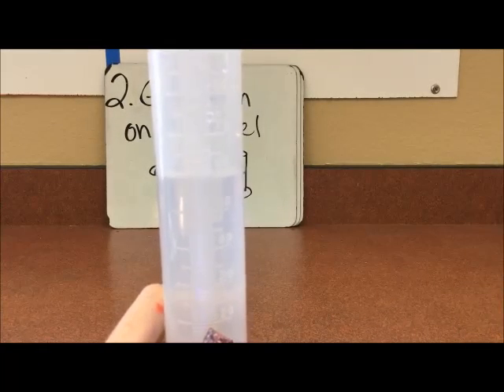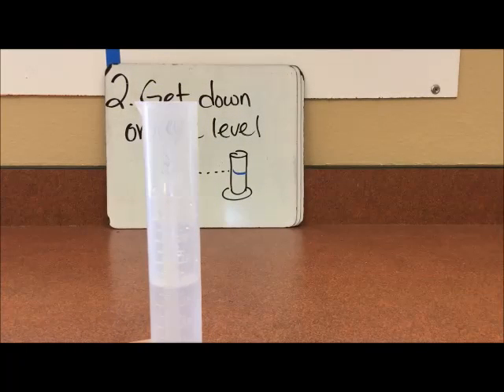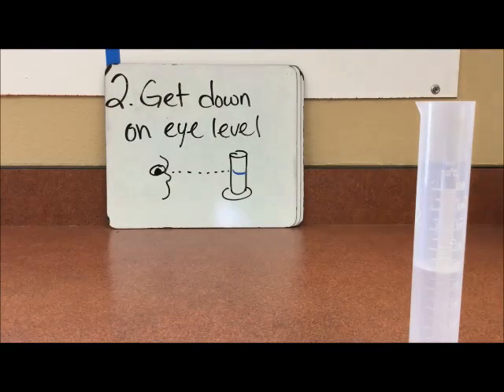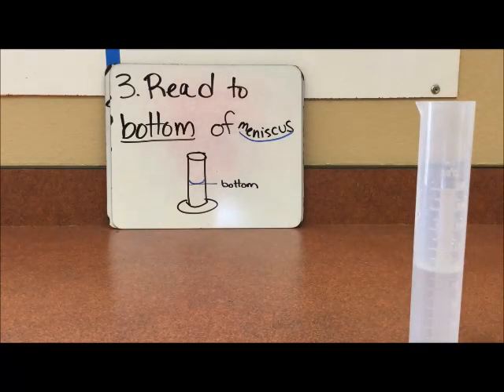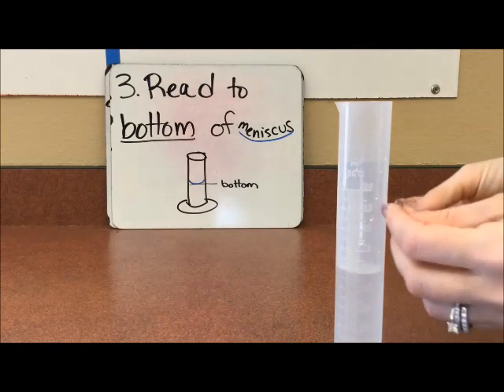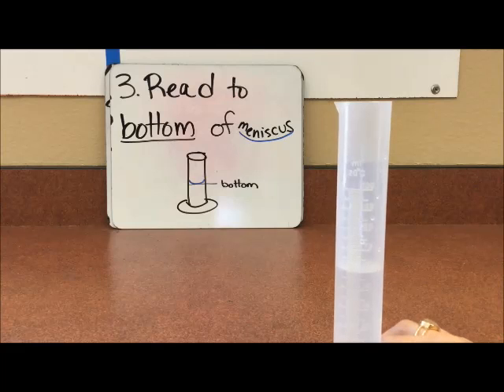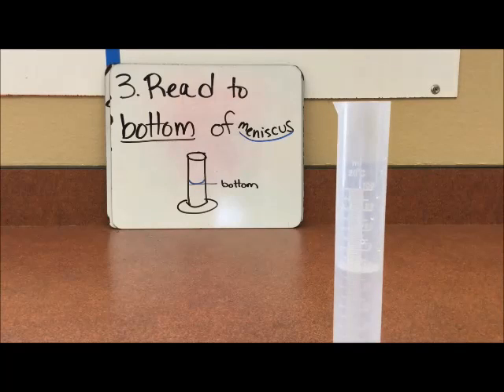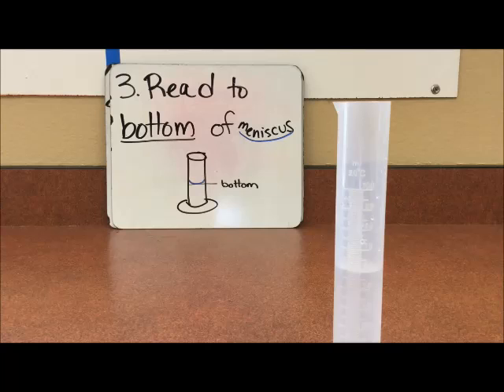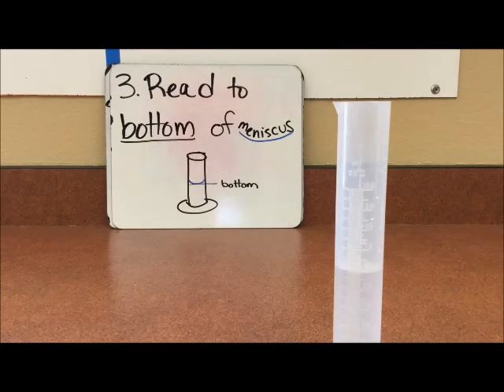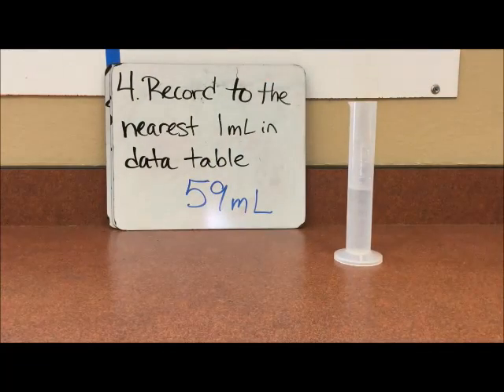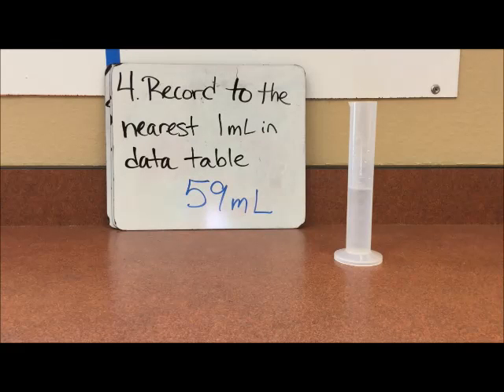Okay, so if you can see here, we're between 50 and 60 and we're about two little slashy marks below the 60. We always on a graduated cylinder read to the bottom of the meniscus, because if we read to the top of the curve that happens, it's an optical illusion that the water starts climbing up onto the sides of the container. If we read to the top we get an inaccurate reading that actually makes it appear as if we're one milliliter more than it should be. So in this case we would record that we have 59 milliliters. And on our data table we would record to the nearest one milliliter, 59 milliliters. There's no decimal places on these guys, so they're pretty friendly and easy to use.